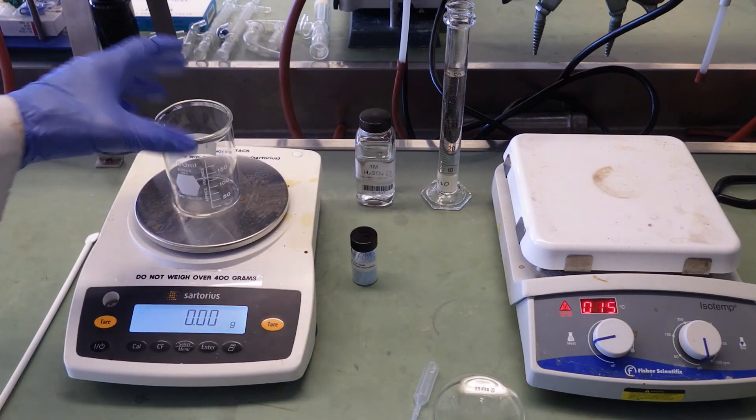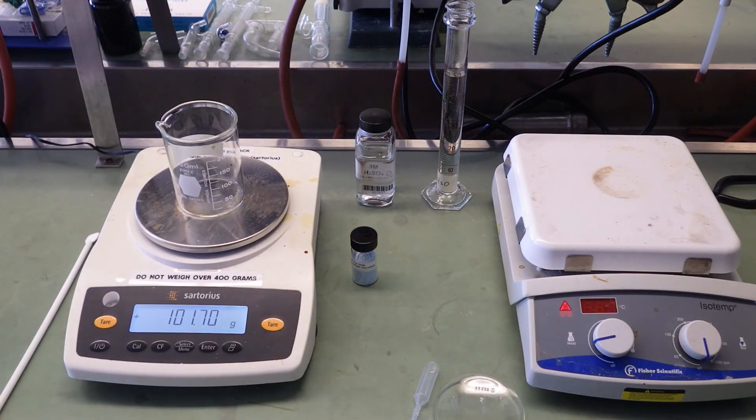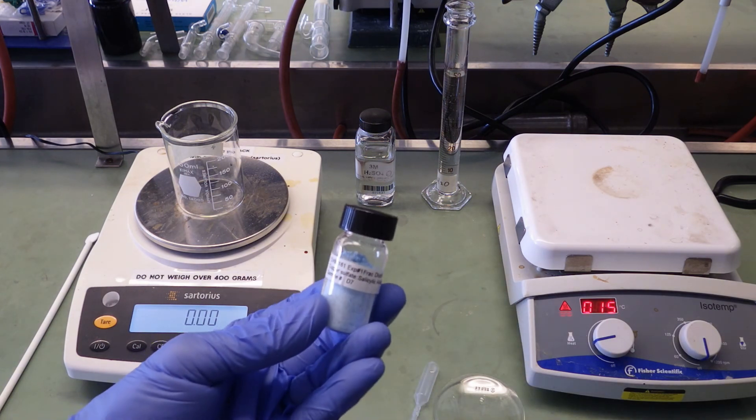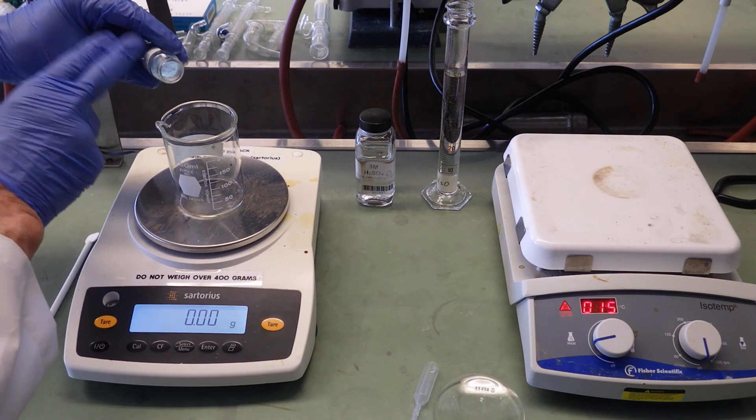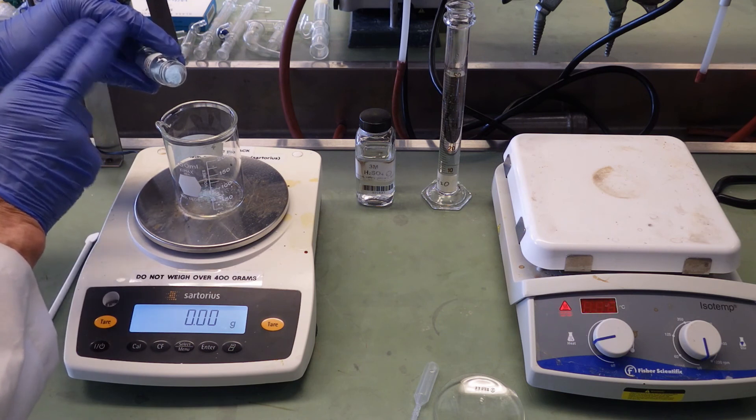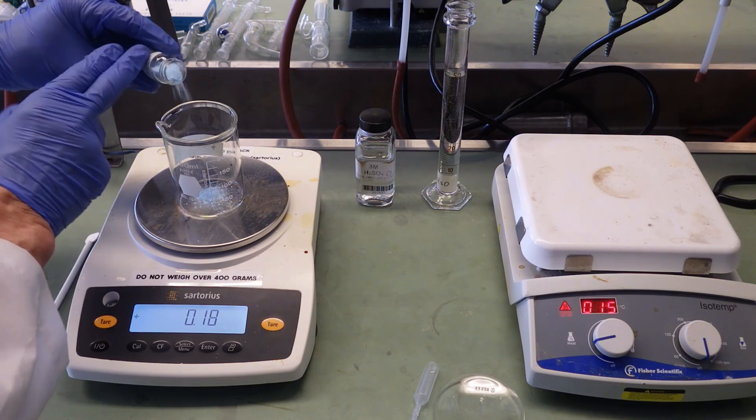We'll start by weighing about 2.5 grams of salicylic acid copper(II) sulfate pentahydrate mixture. Here's the mixture. Because it's a powder, we don't need a spatula to transfer it—we can get good control just by tapping as I'm doing here.